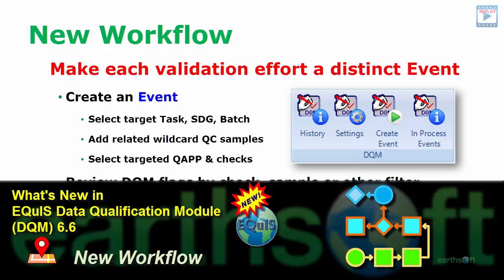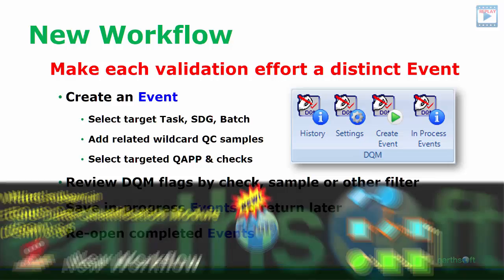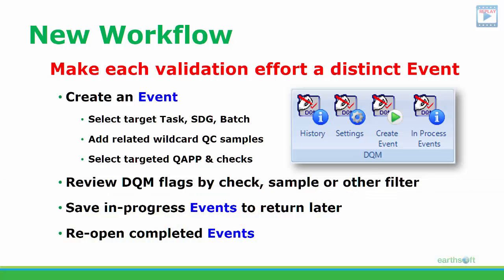So the next thing that I want to talk through is the new workflow, and I have some slides that I'll show you so I can highlight some particular areas, and then we'll actually show you what it looks like in real life, in professional. But essentially the new workflow allows you to make each validation effort a distinct event.